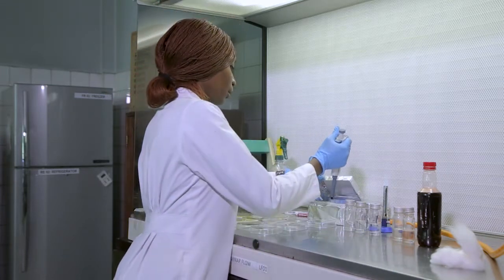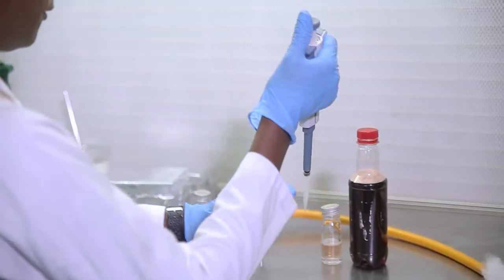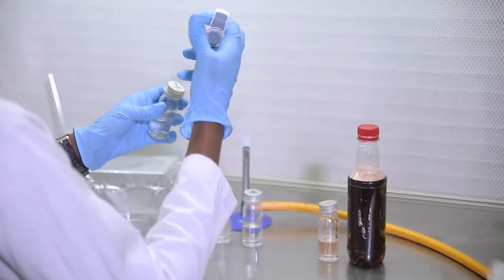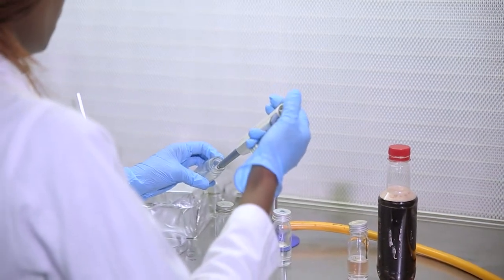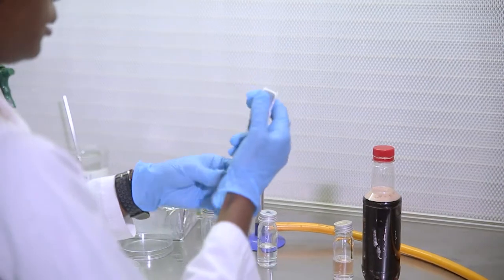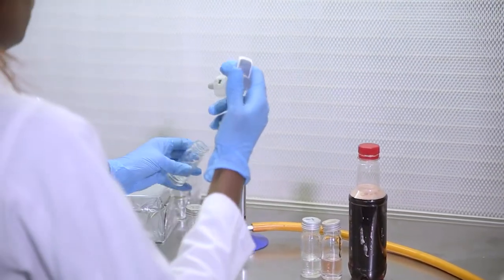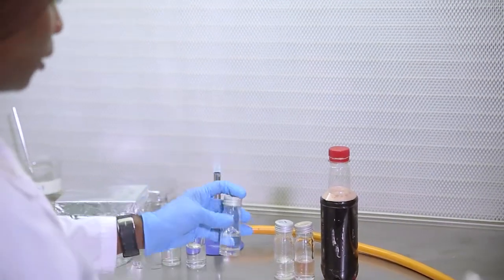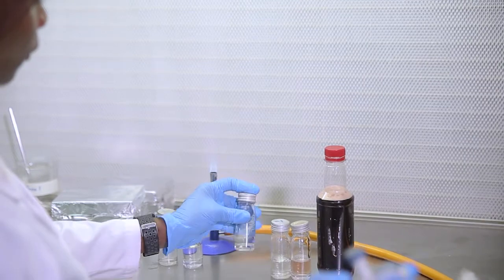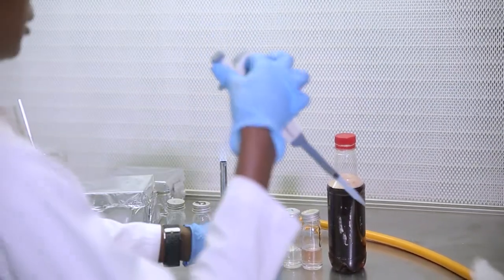So I will continue very fast. So before you pick this, pick 1 ml, cover. You make sure the tip does not touch the liquid. Okay, that is 10 to the power -3.